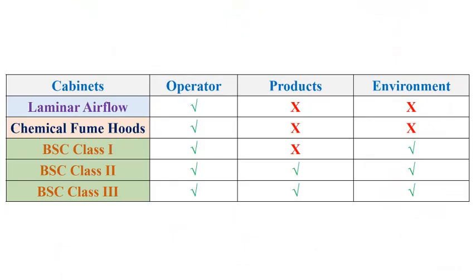In the same line, general difference between laminar airflow, chemical fume hoods, and biological safety cabinets are unrelated to its operator, except products and environmental conditions, that are different between each other in laminar airflow and chemical fume hoods cabinets, as mentioned in next slides.